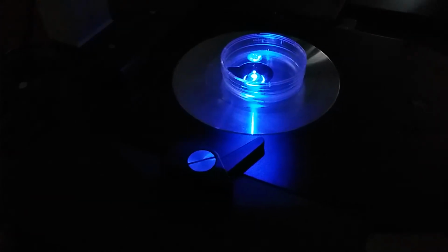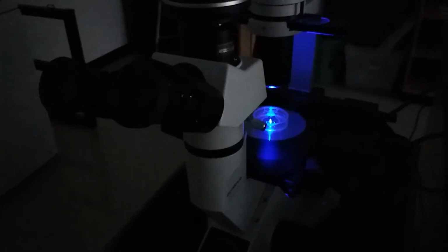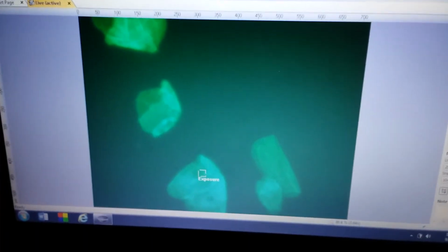This is being excited by ultraviolet light, which we cannot see, and then I'll be able to see blue. The phalloidin is with 488, so I want a blue light. So we're having our cells exposed, excited with this particular light, and we are looking over at the cells underneath the scope, and they are fluorescing green.